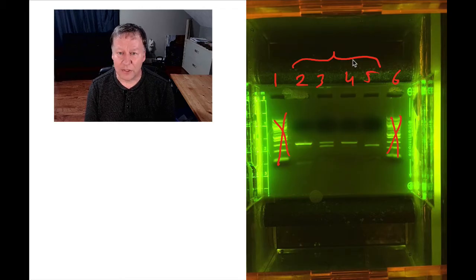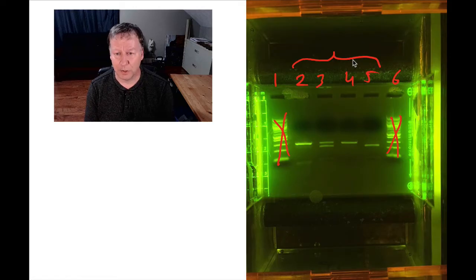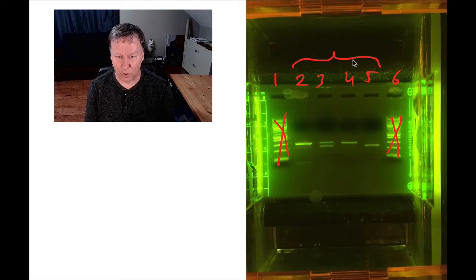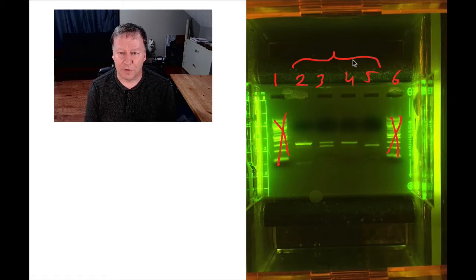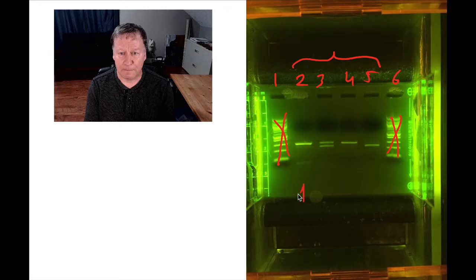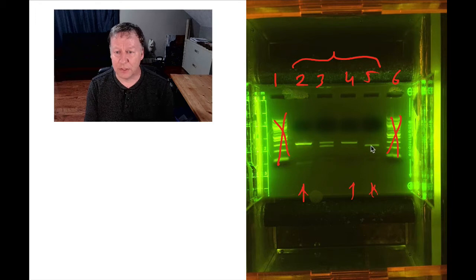In each of the lanes 2, 3, 4, and 5, I have DNA samples that I've run for a period of time, and then I've turned the electrodes off. So the DNA is no longer moving. First off, three of the lanes, lane 2, 4, and 5, I can see one clear band of DNA. So this suggests one piece of DNA of a certain size.